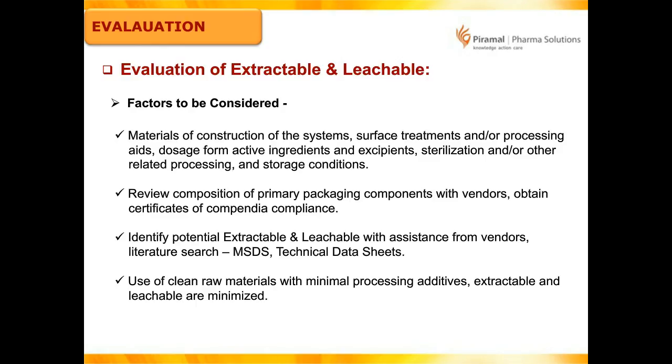Hello everyone, I am back on the webinar. Just to add a few more points on this particular slide, where we are on slide number 16: the evaluation of this packaging component plays a very important role. If a rubber stopper is being procured from vendor X, that vendor will have the extractable information for that particular rubber stopper in the certificate of analysis.